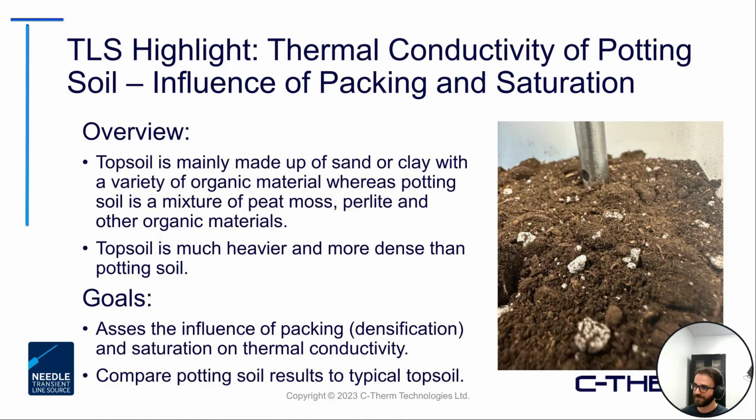So for an analog here in the highlight, we're doing testing of some potting soil. So, the bag of soil you can go and get from these Home Hardware, Home Depot supply stores. And specifically here, we're looking at a few different aspects, the influence of packing and then also saturation. So taking a look at how really the densification and saturation influence these results.